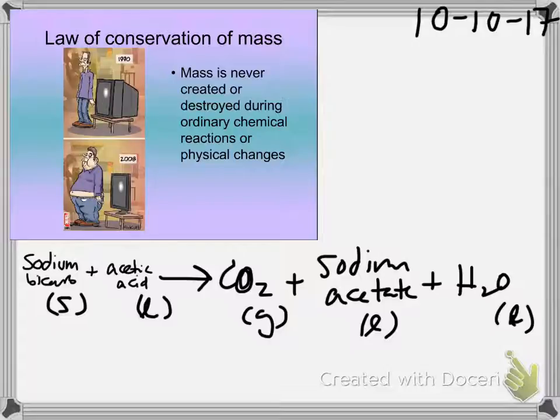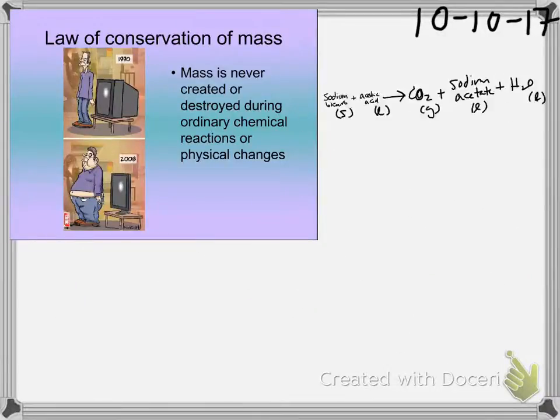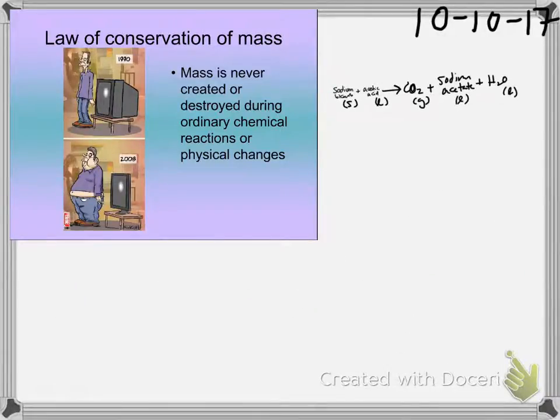Now the second part I think went better for people. Did everybody gain a little bit of mass on the magnesium? Okay. So here, what we should have seen, of course, was in an open vessel, a loss of mass. But in the other case, we saw a gain of mass with seemingly just that magnesium. Now, you and I know what happened. What happened? Do you know what happened?